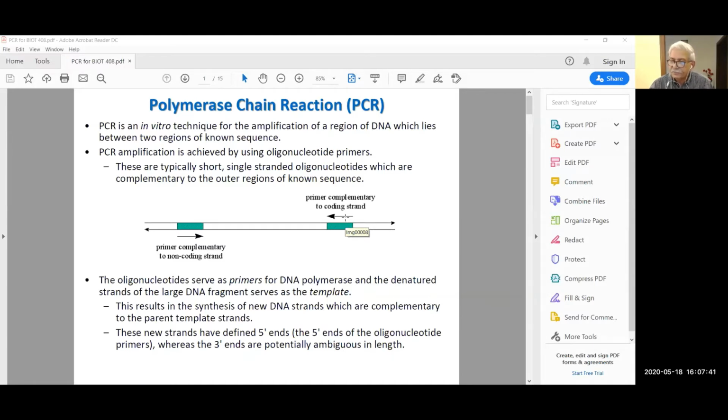What else? The nucleotides will be required for incorporation by the DNA polymerase. If there is no nucleotide, the system will not work. The DNA polymerization will not take place. Okay? So these are some of the basic requirements which everyone requires before setting up a PCR reaction. We add just water in there to get the optimum concentration of every constituent that we add into a PCR reaction.